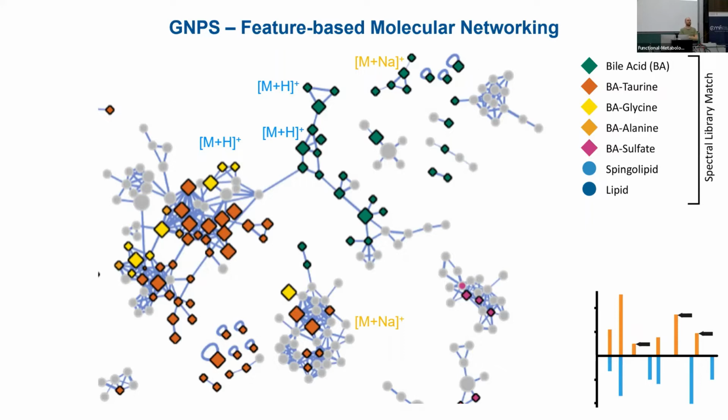When you establish a connection between the parts, do you just take into account the presence of some fragments, or do you also take into account intensity ratios and losses? Yeah. So the cosine similarity takes into account intensity. That's an essential part of the algorithm. There's some pre-filtering that is done, and usually the intensities are scaled. So you use the square root of the intensity, so that very abundant signals don't overweigh everything else. But then you have the cosine similarity. It's a very simple metric, but it works pretty well for this kind of data.